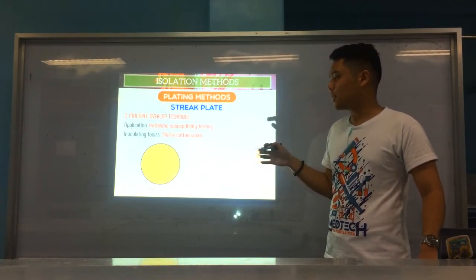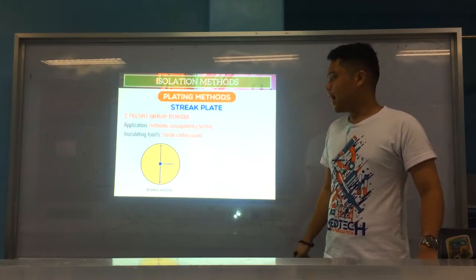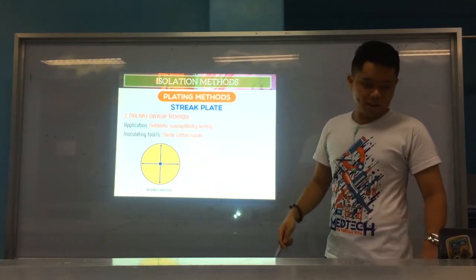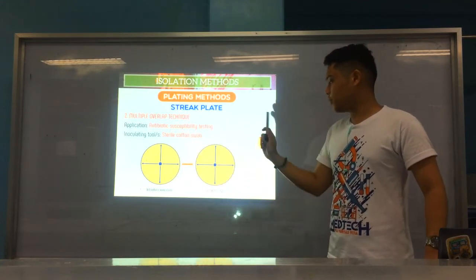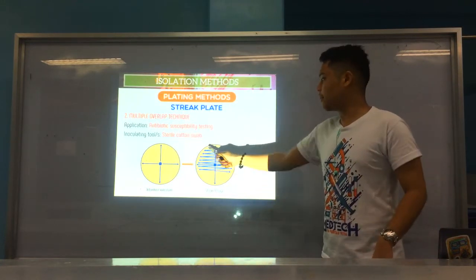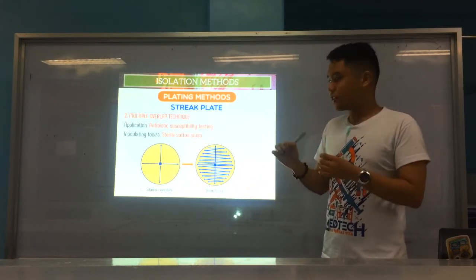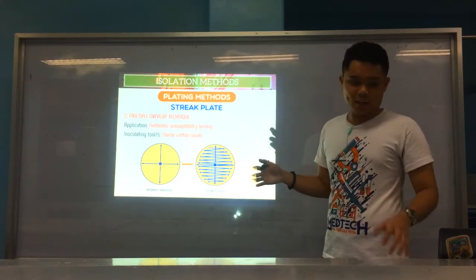So we'll start first by introducing the inoculum as always, at the middle, okay? And then you streak on 4 sides. So you streak up, down, left, and right, okay? And then finally, you streak the first layer. Always make sure that the streaks are close together. Okay? Like, the distances in your streaking are close. Alright? Because you want to make sure it is covered by bacteria, a lawn of bacteria. Okay?